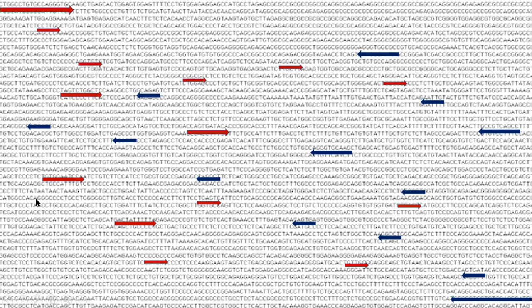So let's say I make it all red, leaving the typical PCR primers of long complementarity, 20 base pairs. These primers are shorter, 8 to 12. So I'm making only one color now, not red and blue. I made a primer with a random ATGC sequence, and I used the same primer as forward and reverse when doing that reaction.